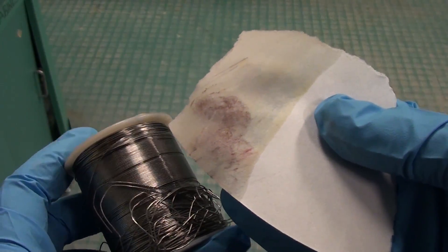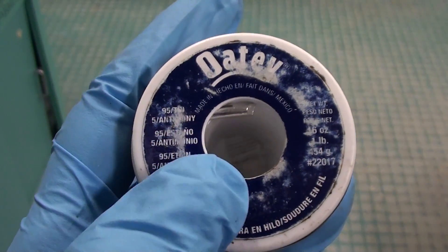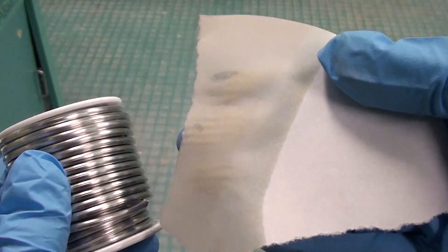Now let's try this lead free solder which is 95% tin and 5% antimony. Rubbing the test paper we can see no trace of lead, as expected from a lead free solder.